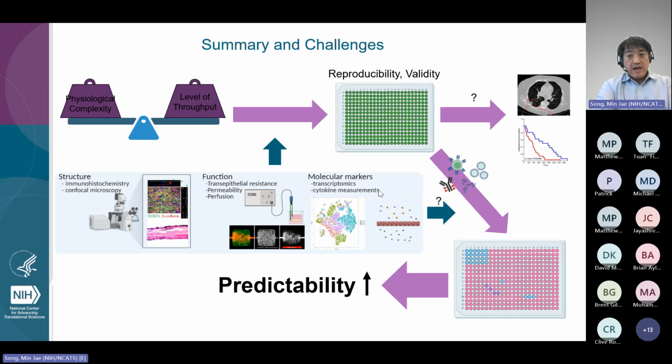For technical challenges, of course, I previously mentioned the reproducibility of the model outcomes. Reproducibility of the model is also challenging, and at the same time, the limitation of the current technology hinders the high throughput measurement of time-sensitive functional outcomes of the 3D tissue models, such as vascular permeability, neuronal activity, and muscle contractility. So as the 3D tissue model is sitting right between the 2D monoculture and the 3D native tissue, the assay readouts from the tissue model need to be carefully evaluated by bridging studies with the clinical data.